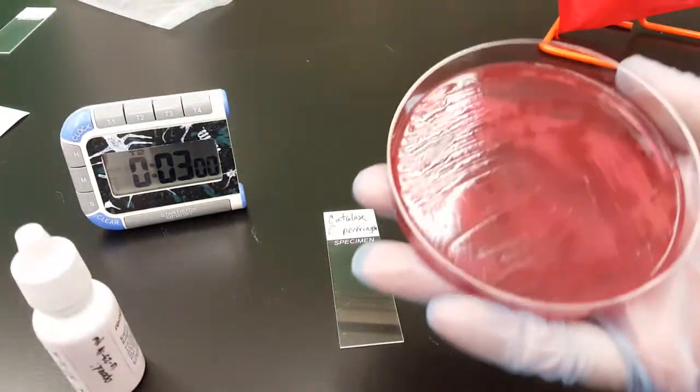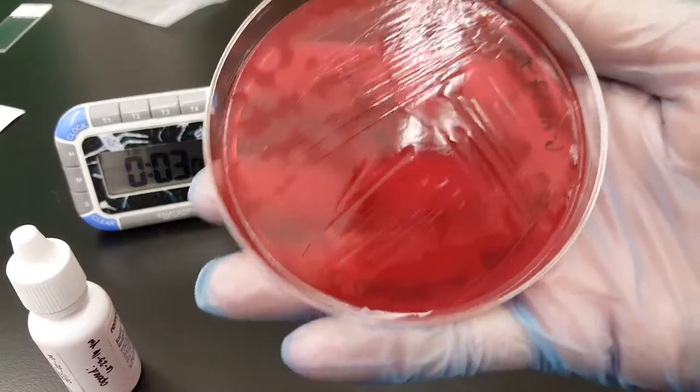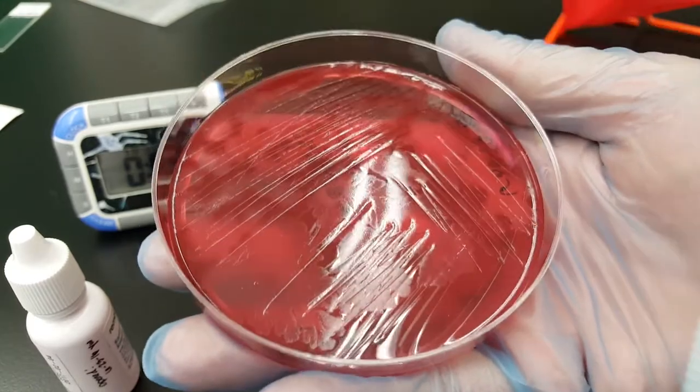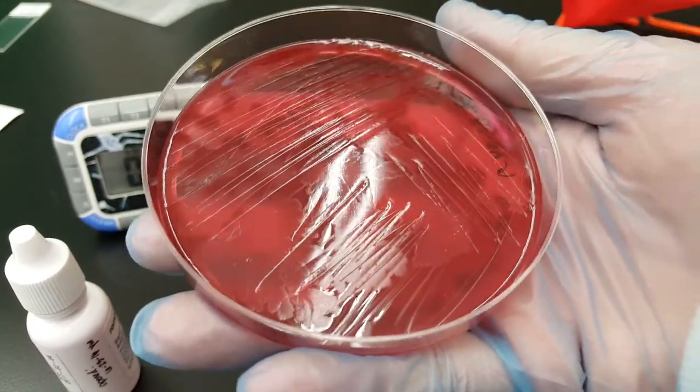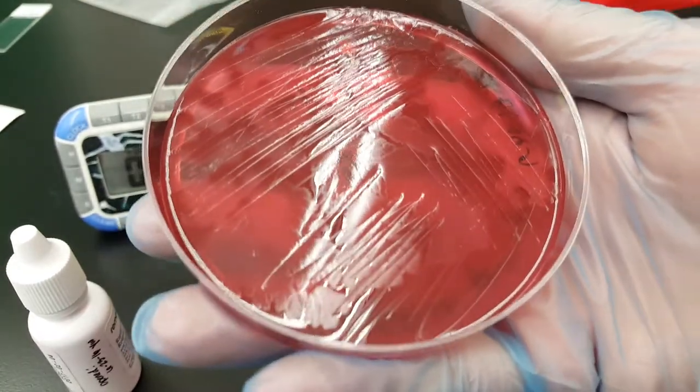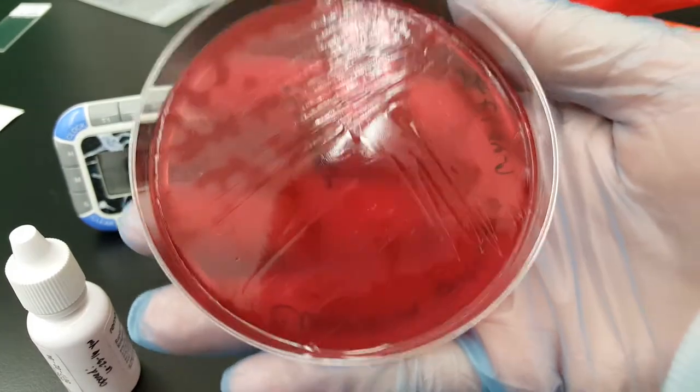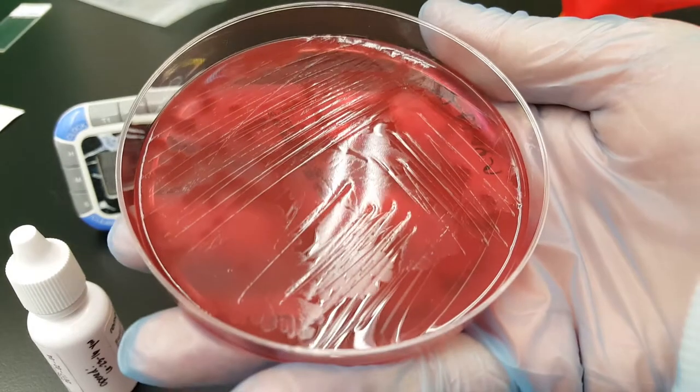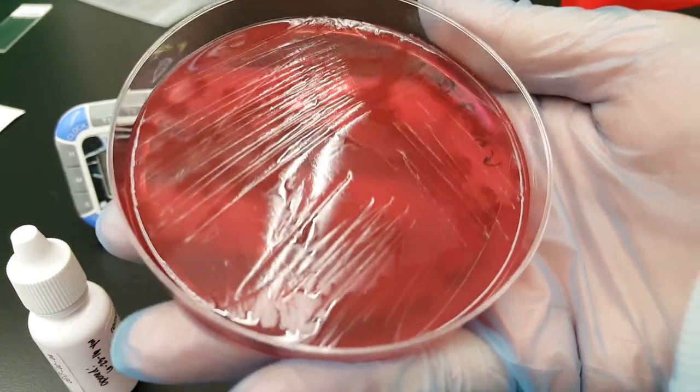And here are the colonies. They're very spread out. Oh my gosh, look at that. It's like lakes of bacteria. They're just spread all over. That's why you can't really see them to take a picture, because they're just spread out. See the sheen on there? That's all colony. Woo! That's exciting.